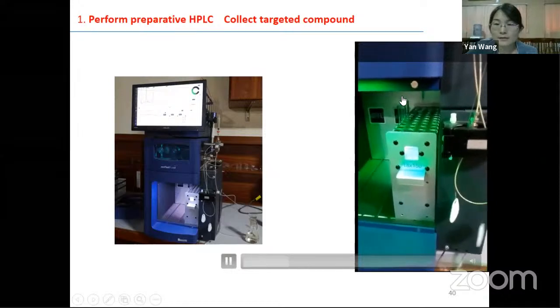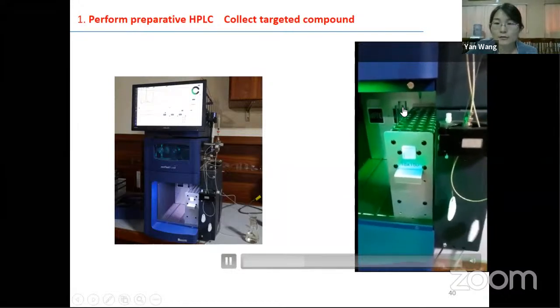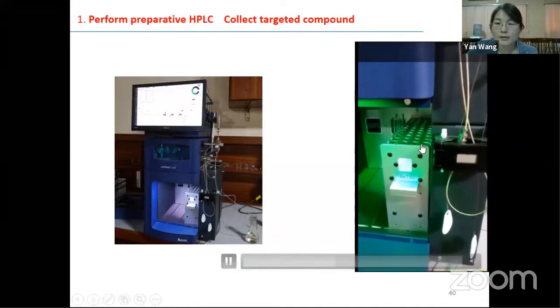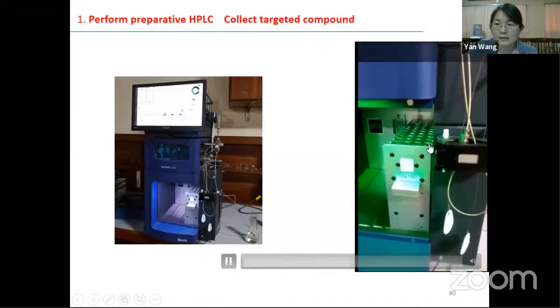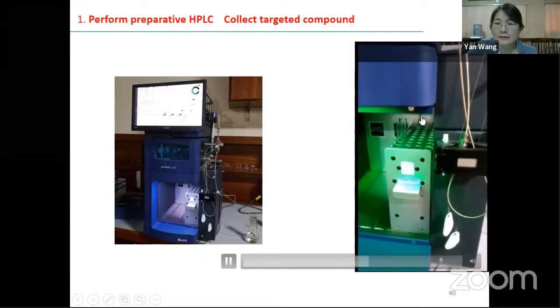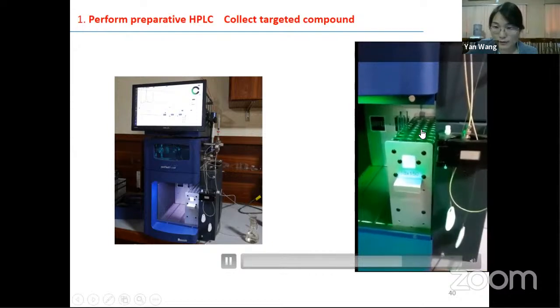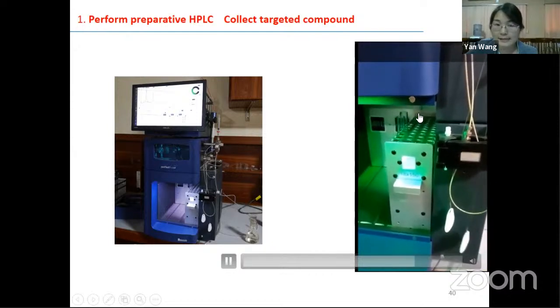And here, these 2 tubes are very tall. You can see the other tubes are a little bit short. You are not able to see, but there are many tubes organized here. And the drops from the column keep dropping into this tube. This tube is automatically collecting.